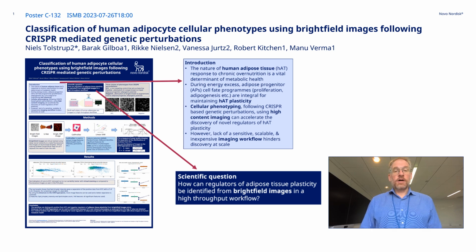Brightfield imaging of adipocytes is a sensitive, scalable, and inexpensive readout. But how can regulators of adipose tissue plasticity be identified from brightfield images in a high-throughput workflow? Stay tuned to learn more.